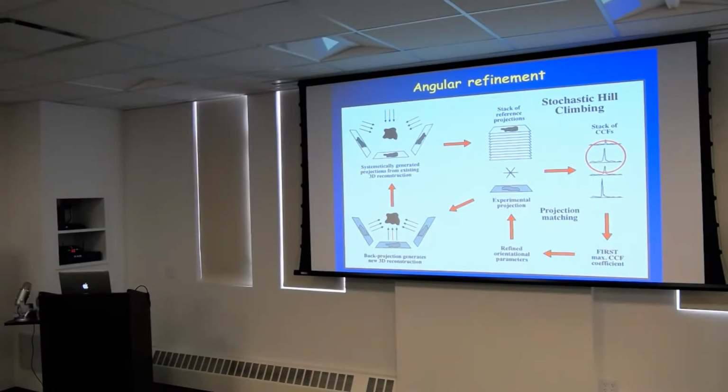It's all a little bit convoluted because you start off with something, and there's also 3D classification involved. So basically refinement is just you have one map and you have images. Which images you choose is up to you. So you can do it in different ways. You can choose everything and then say, oh, from a certain correlation, it's so bad, I just ignore these and I don't use them to calculate the map.